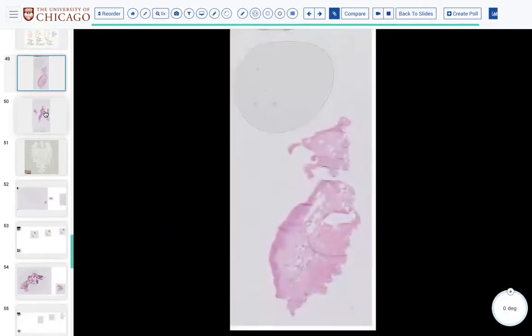Does that all make sense? All right. I think so. Cool. So then in the next couple of slides, I have some tumor bed margins that I wanted, hopefully, if anybody wants to drive them, you can, otherwise I'll just do it.